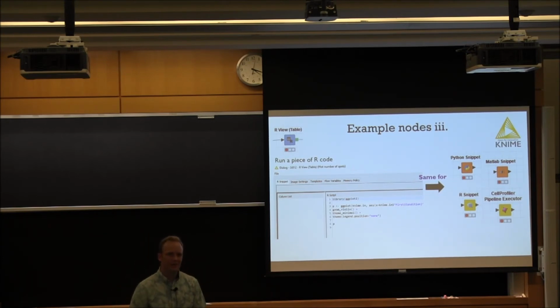Do we need to handle the different formats between different programs, different languages? That's a really good point. Which is quite useful, actually. So how does it handle this? I'm not sure, but I have not run into a case where I have to worry about different formats. Usually once it's in KNIME, you're fine, and then you can change your formats to whatever you want.